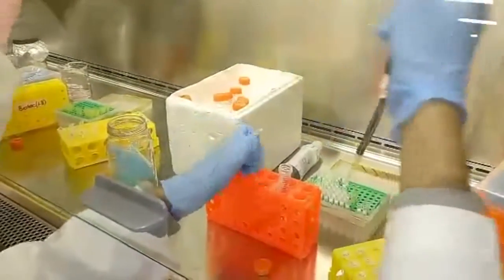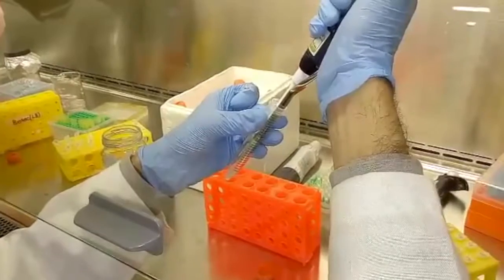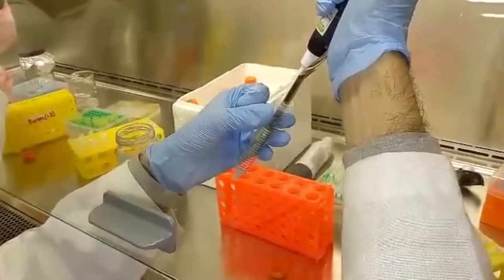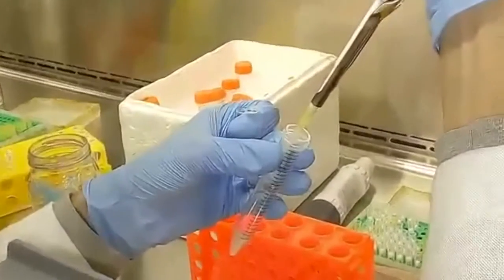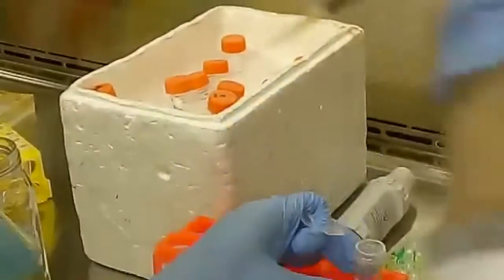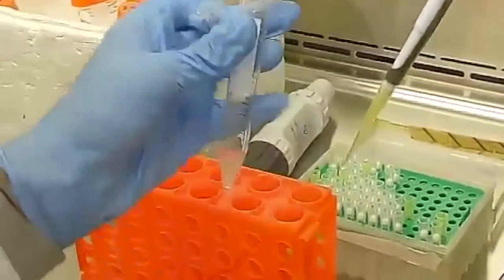Now, the PCR 2.1 topo has several elements important to work. These elements include the LacZ-alpha, which codes for beta-galactosidase, the multiple cloning site or polylinker, which is a short segment of DNA which consists of many restriction sites commonly used during procedures involving molecular cloning or subcloning. The T7 promoter, which catalyzes the formation of RNA in the 5'-3' direction.